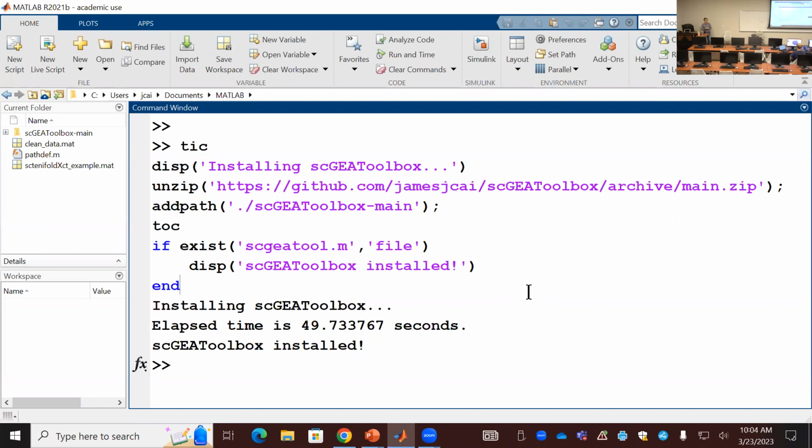They are not consistent. How can you synthesize and put them together to generate this so-called meta visualization method, to learn from all the different kinds of embedding to give you better resolution, probably. I haven't tested this in real applications, but the function has already been implemented and provided in the toolbox.